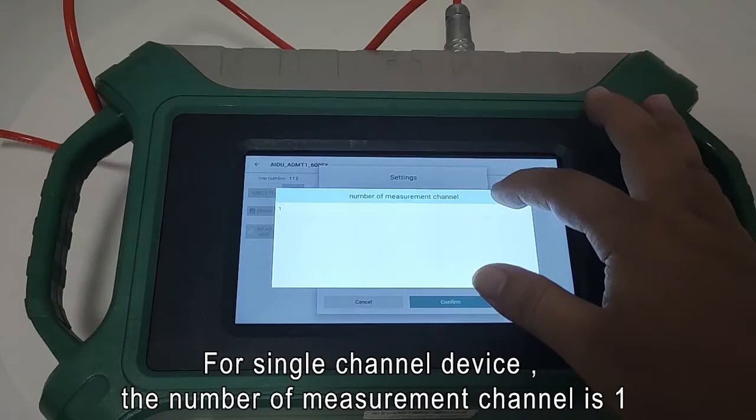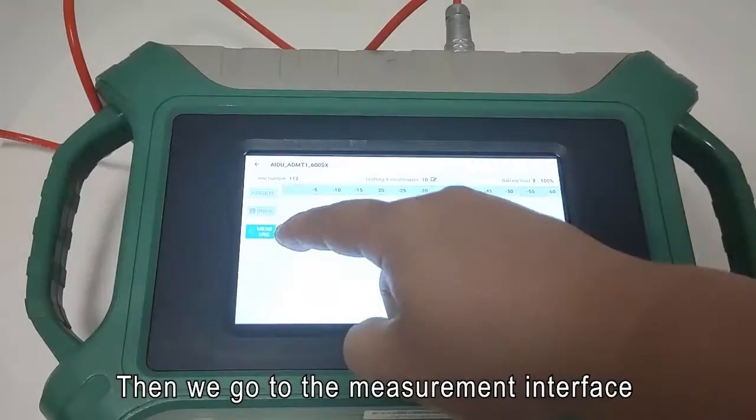For single channel device, the number of measurement channel is 1. Then confirm the setting.